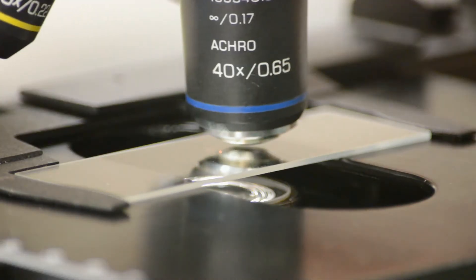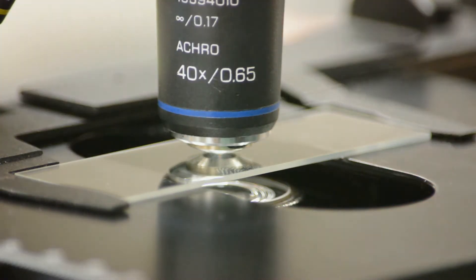Once we have it focused we want to make sure that our material is centered. We go out, we grab the turret, we rotate and bring the high dry objective which is the 40x objective in.